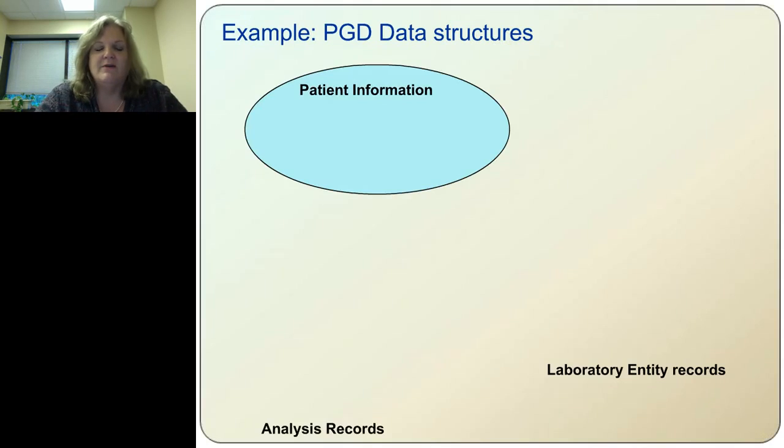So when we check in, for RMA Genetics, when a patient requisition is checked in, we have all the patient information, independent of the actual samples that are run. Those are usually sent to us ahead of time. So here's a patient, and it's usually focused around the female. She's going to have a cycle. We keep her information, her date of birth, and other identifying materials, and when her cycle will be.